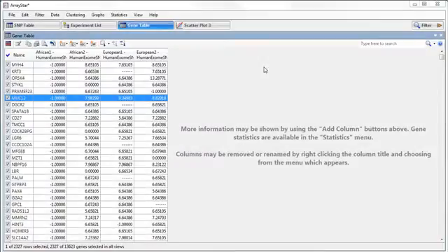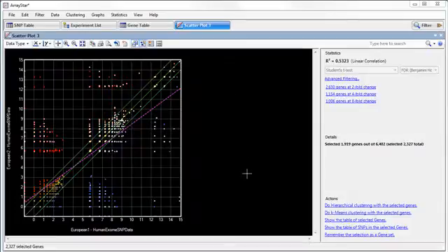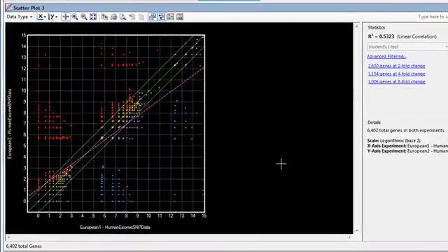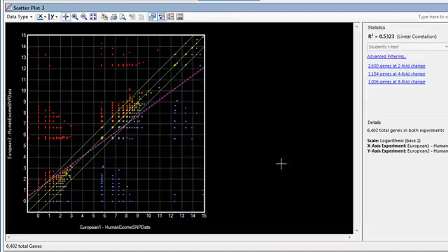Now from this point, you can go several different directions for further analysis. For example, I can look at the gene score values in the scatter plot, which allows me to compare genes between individuals or groups of individuals and see them grouped by their level of disruption.